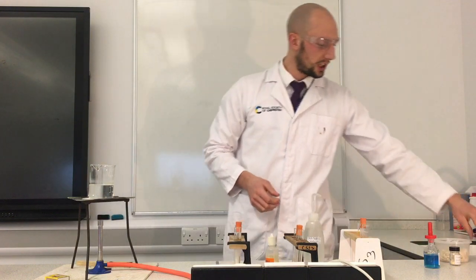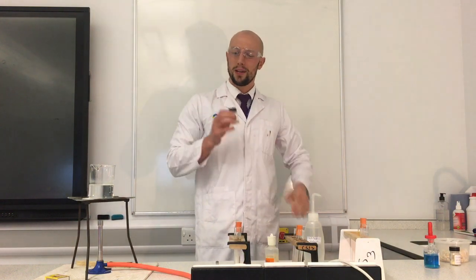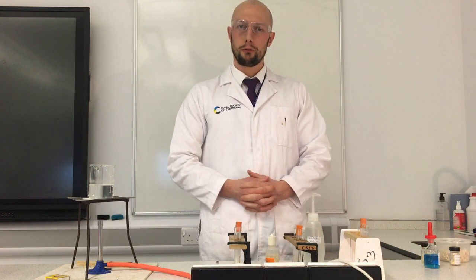And finally, the last thing I did was I took some oil like you might cook with. And we found that the oil contains fat, but it doesn't contain glucose and it doesn't contain starch. And that is what we've learned from our 3 food tests.